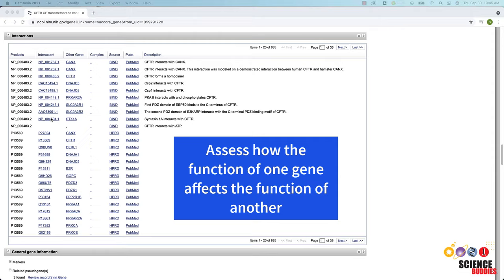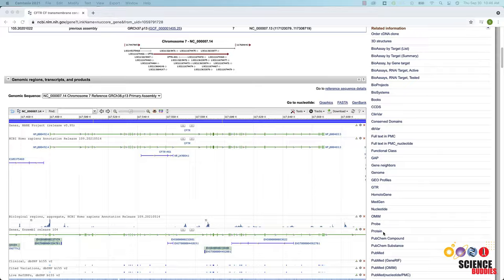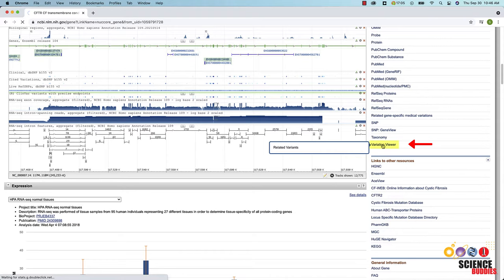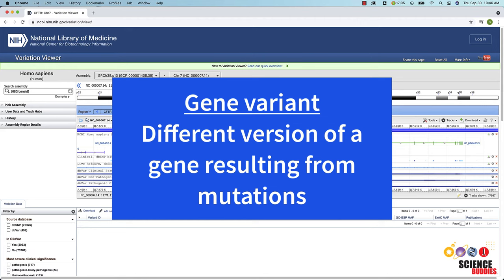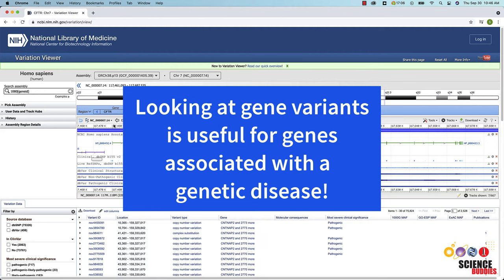On the right side of the page, you will again find a related information section where you can go to the related nucleotide or protein entries. Further down the list, you will see a Variation Viewer link that brings you to a page with related variants of that gene. A gene variant is a different version of the gene resulting from mutations. You can also get to the Variation Viewer from the Variation section on the Gene page. Looking at the variants of a specific gene can be especially useful for genes that are associated with a genetic disease, such as the CFTR gene.